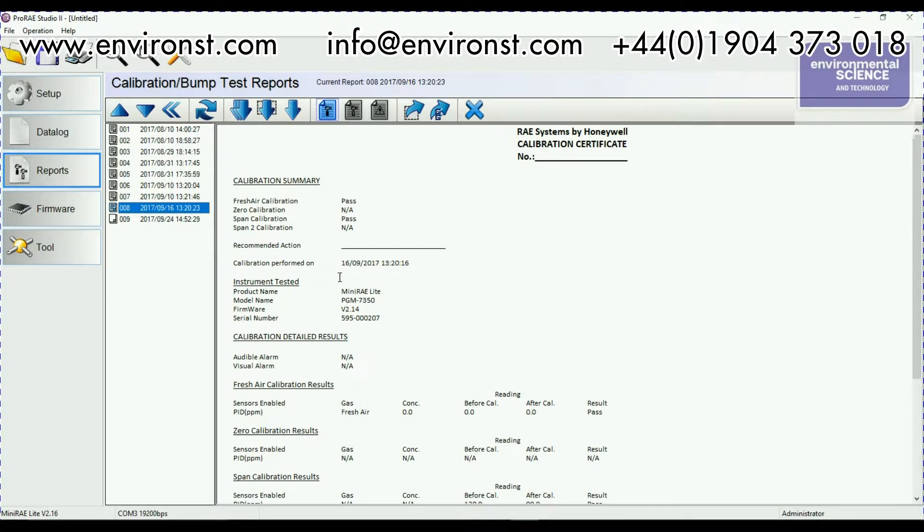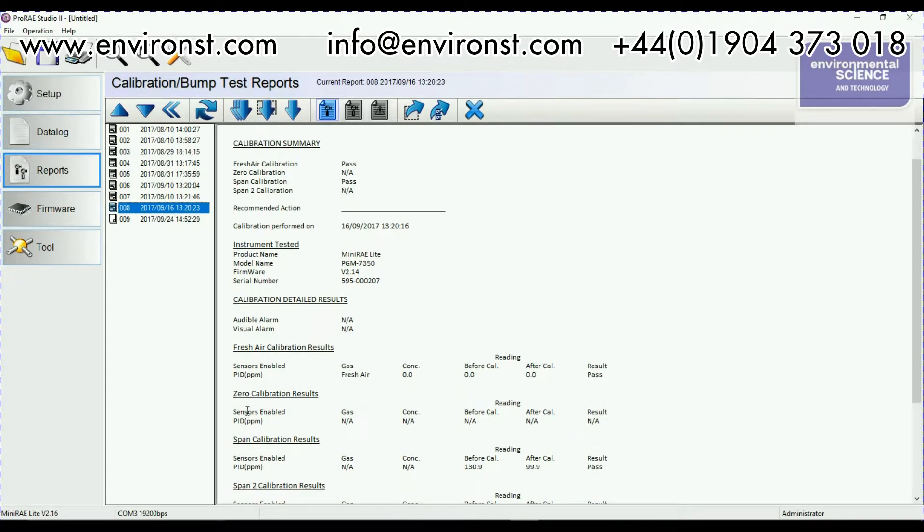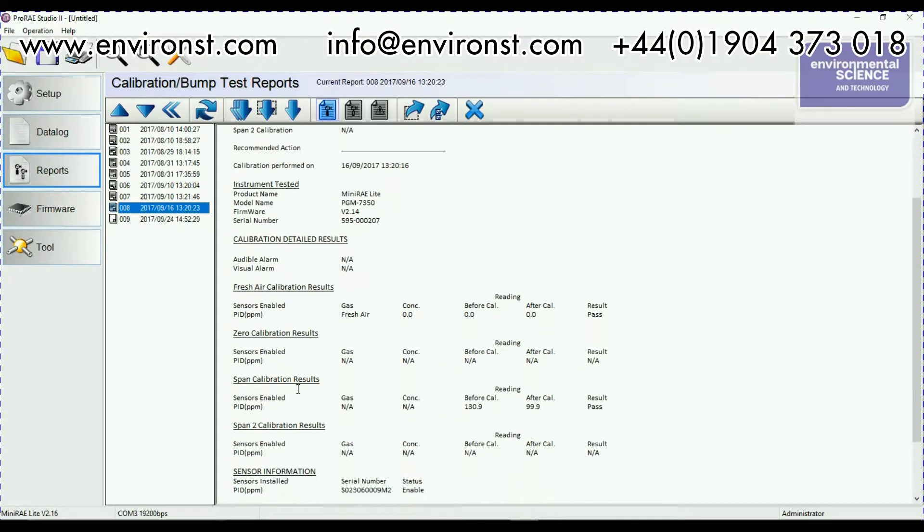If we have a look here you've got your calibration summary. So it's a pass, a pass, it was done on 1609 2017 at 1320. Gives the model of unit, its firmware variant and then basically it goes through all the calibration results.